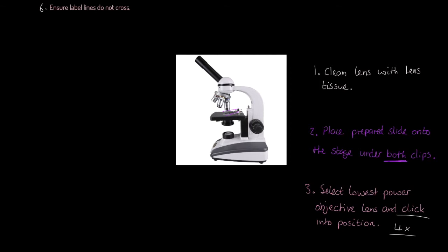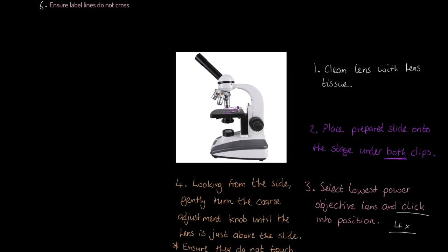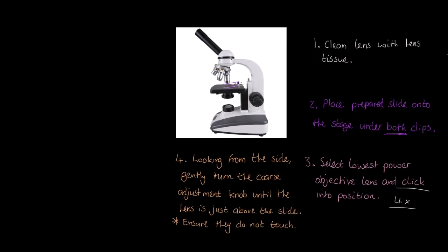Next, and this is perhaps where very frequently things will go wrong, but this is where we want you to be really hyper accurate. Looking from the side now, so we're not looking through the eyepiece, gently turn the course adjustment knob until the lens is just above the slide. We're bringing the stage up until there's very little distance between the lens itself and the specimen. But importantly, we do not allow them to touch, which is exactly why you're looking from the side.